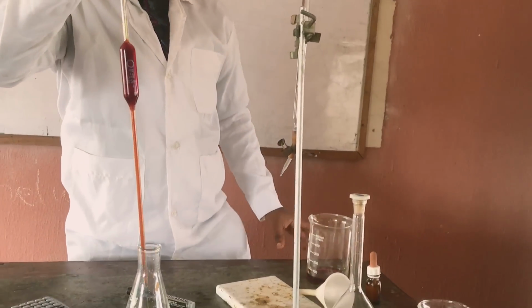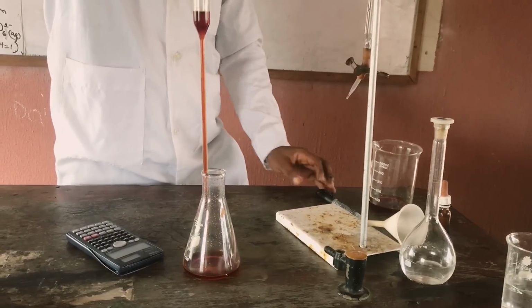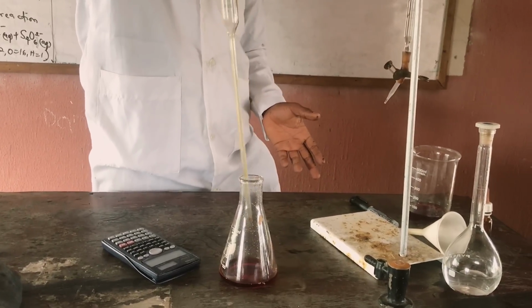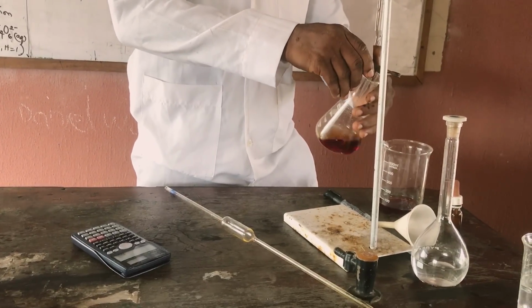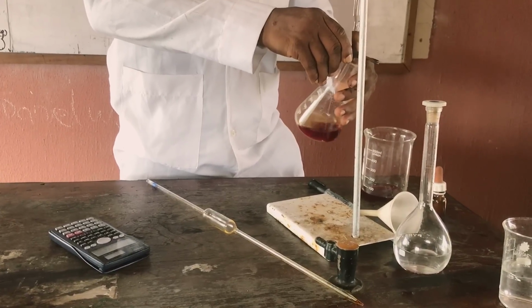Okay. I hope you are getting it now. So we don't have anything to worry about. Just obey the instructions given on that day and just do your titration and you are fine. Okay? This is the second one. Let's go again. And you say light yellow.